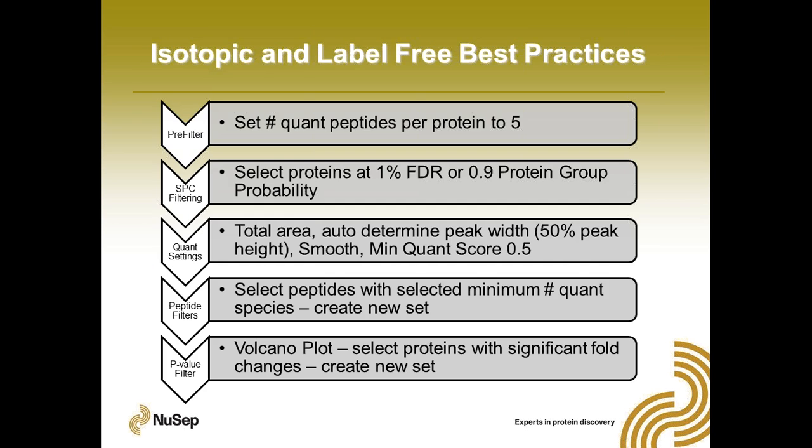All right, let's shift gears and talk a bit about best practices with 2.6 and how we recommend going through the project setup. And you'll certainly see more of these webinars in the future, but I think now this is the process that we're recommending to all of you.